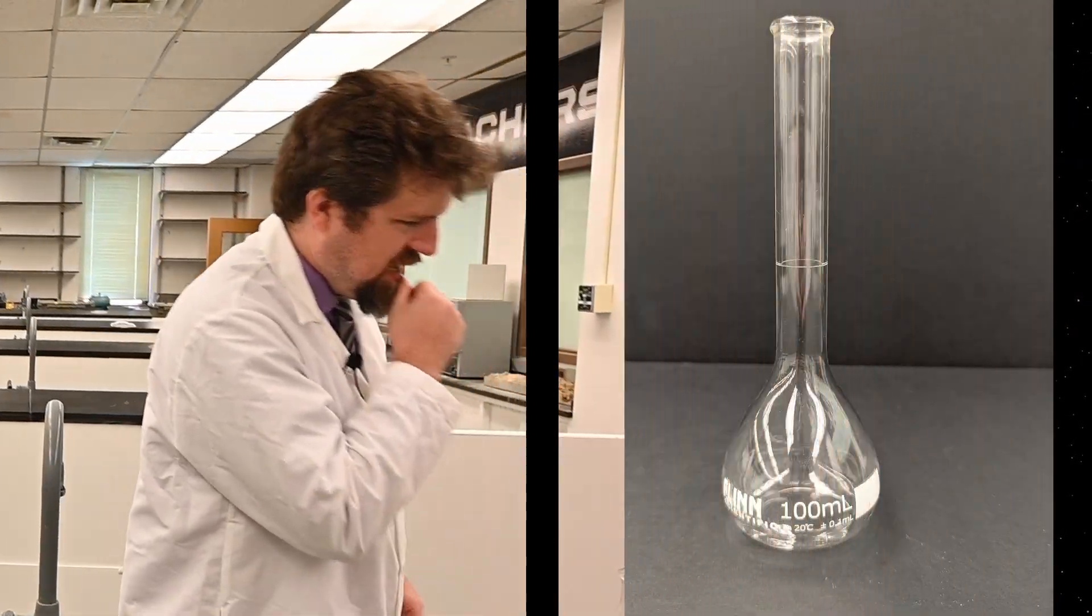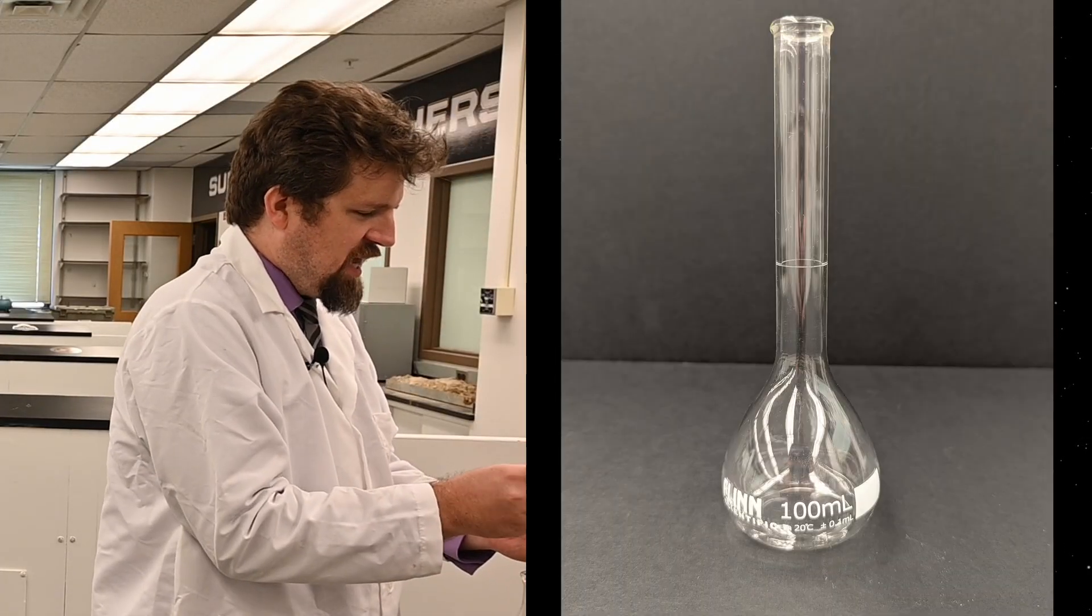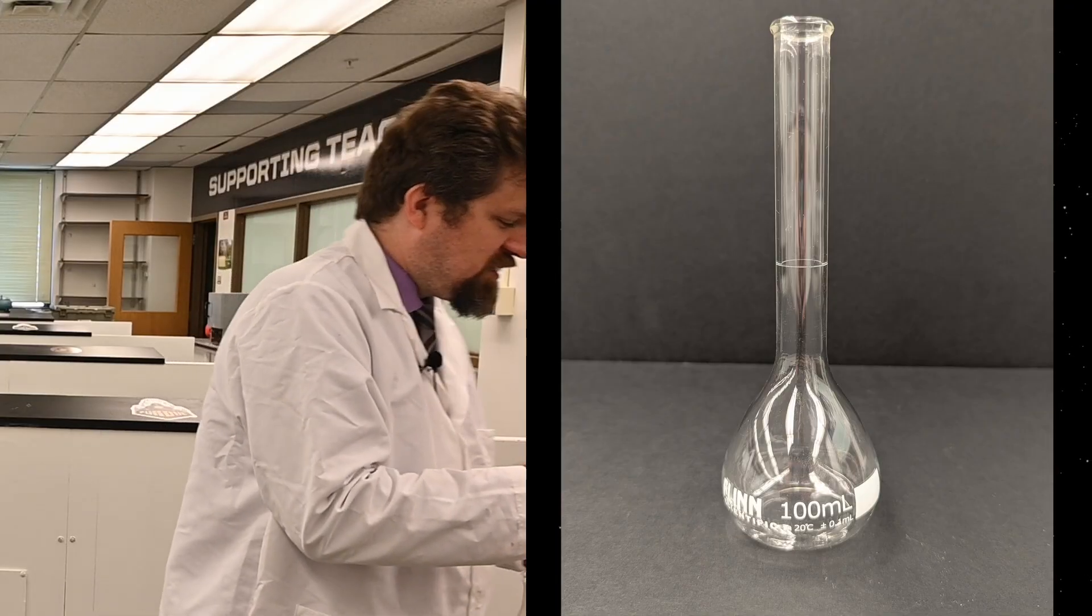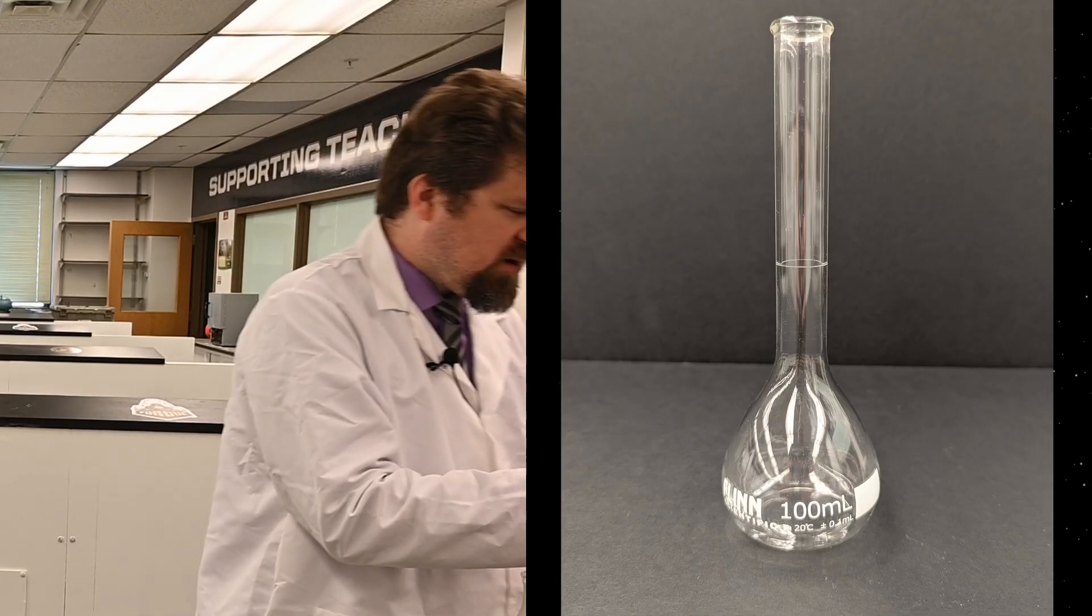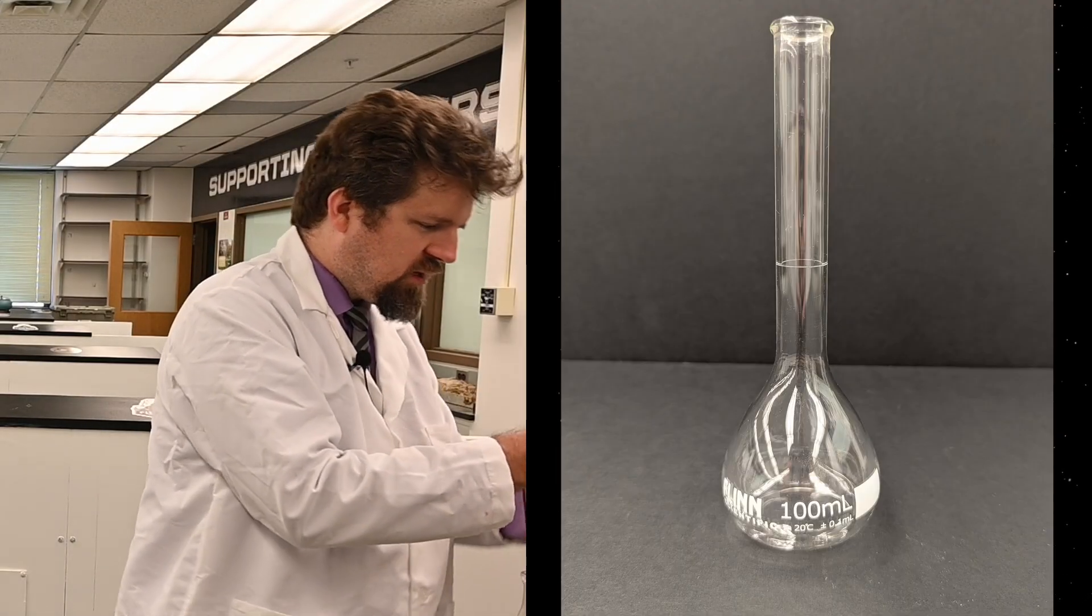Different types of flask. This is probably the second most common one you're going to see. This is called the volumetric flask, and it's weird in that you can notice that it has a much taller, skinnier top.